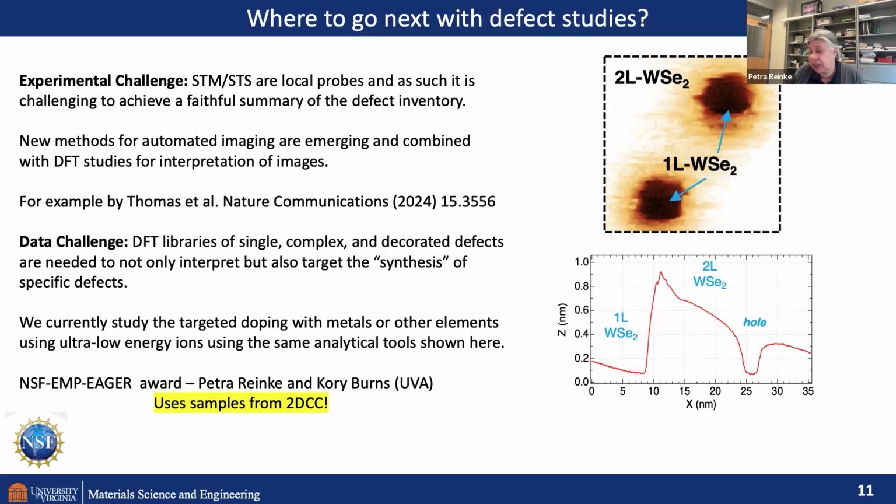There's also a data challenge which comes from the DFT side, and the analysis of the images. The more images you get, the more difficult and more time-consuming a reliable analysis gets. We analyzed about 40 defects, which I think is about the limit in terms of doing this by hand. So we would need a library of defects, and there also is a drive in the community to get there.